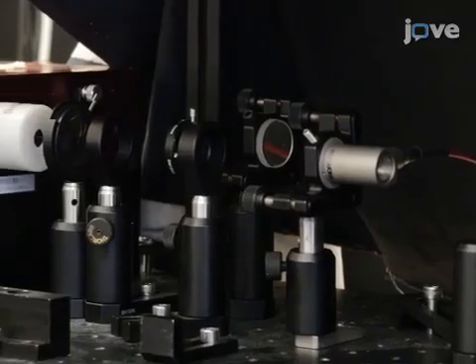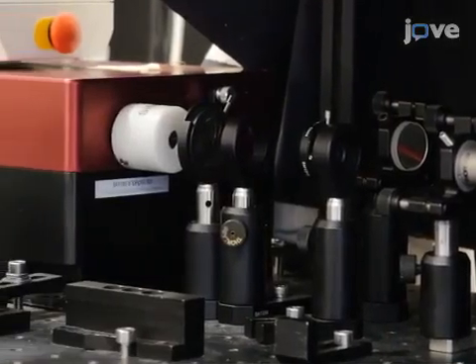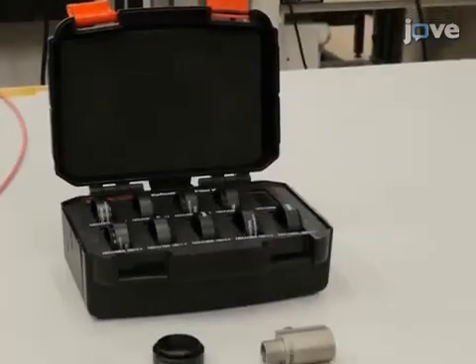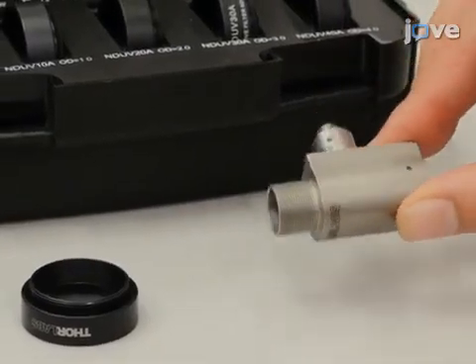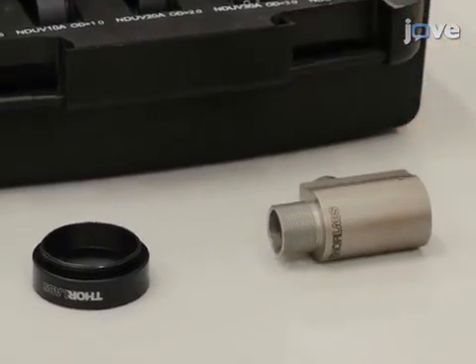The laser is tunable over visible to infrared wavelengths. Required smaller optical elements include an off-axis parabolic mirror coupler and neutral density filters.